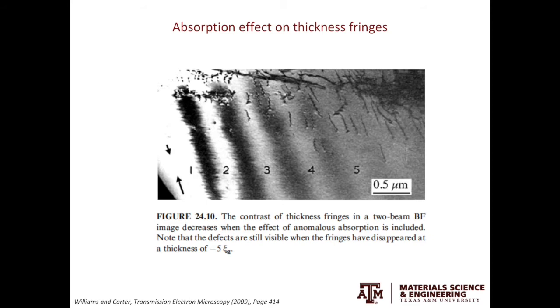Here is a good example showing both the thickness fringes and the absorption effect. As the sample gets thicker and thicker, you don't really see those thickness fringes.